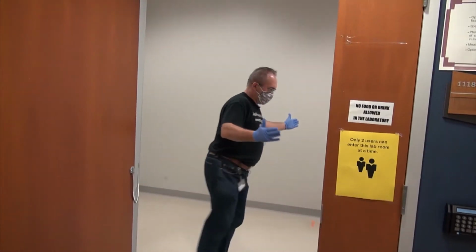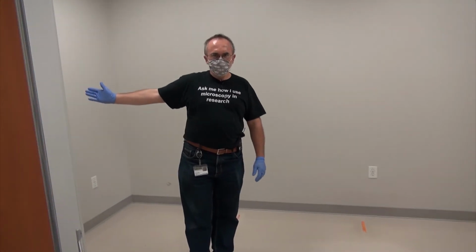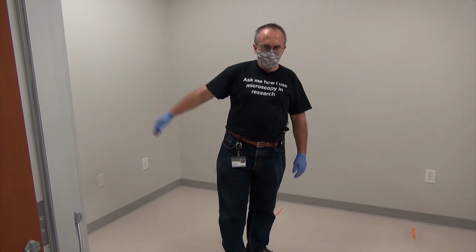So this is the room for sample prep for the cryo SEM as well as for the cryo TEM that is next door.